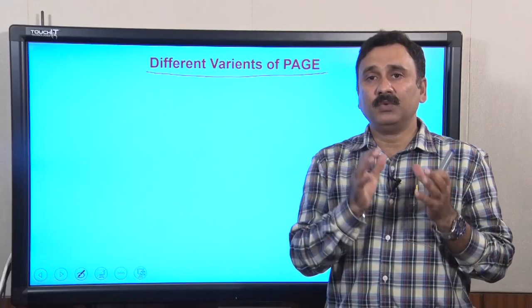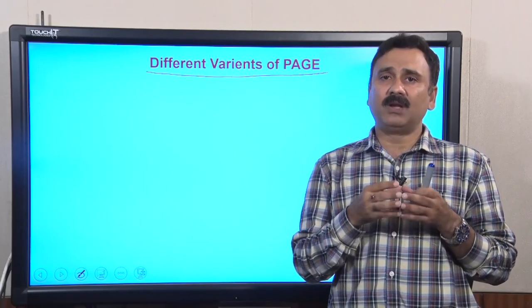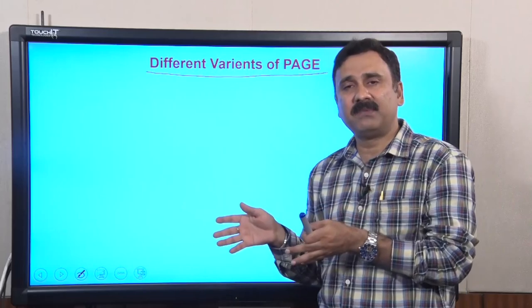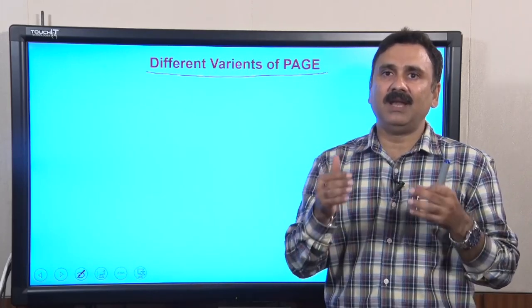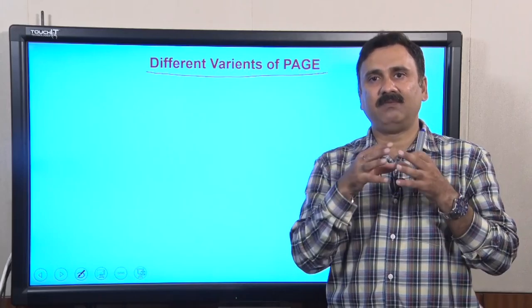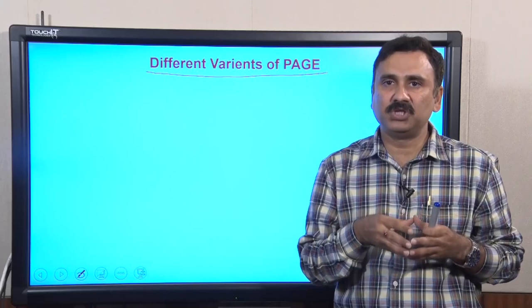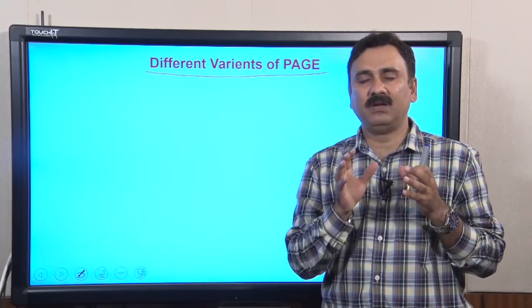Explaining the different steps of image analysis using a separate software, we have prepared a small clip which will allow you to see all these steps which we have just now discussed, where we are selecting the lane, selecting the bands, then telling you how to measure the intensity and how to measure the position of this particular band. So all these we have prepared in a small demo.